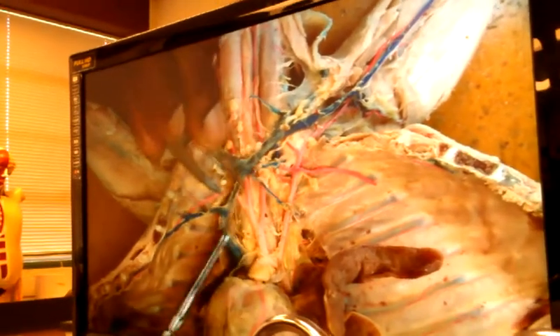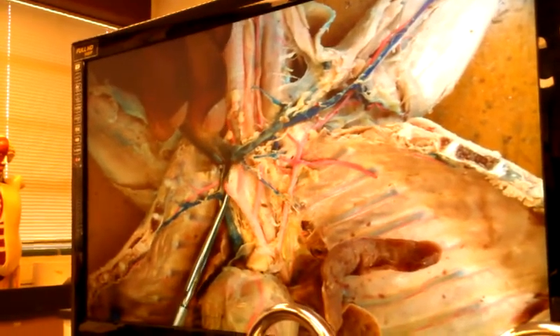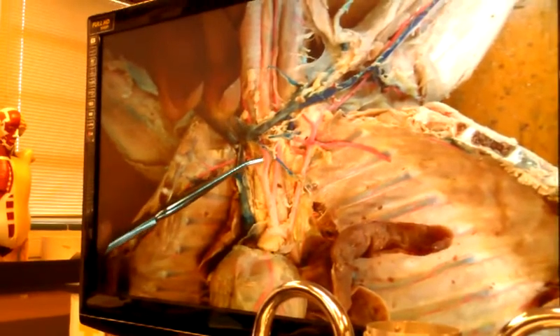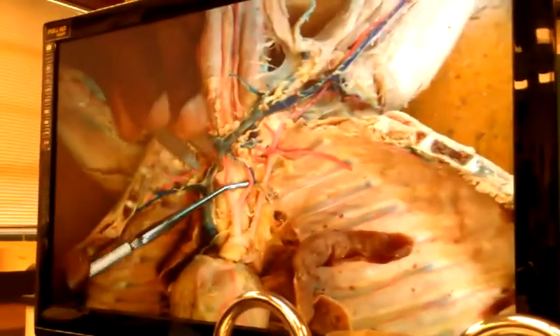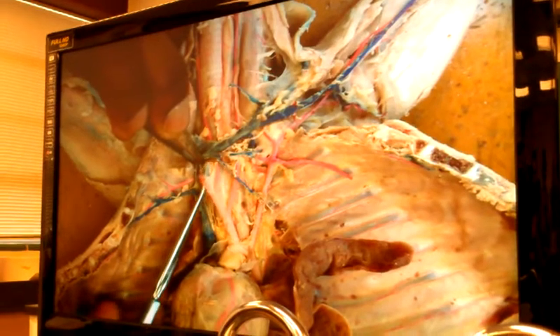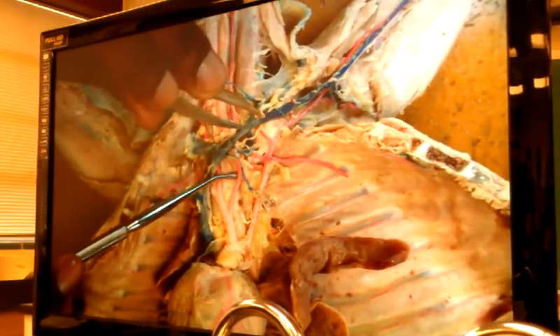But show me again, Mr. Gilmore, what are the three main structures you see coming off? One is going toward the right arm, so we're going to call him right subclavian artery. Then there's one going right beside the trachea. That name, he is right common carotid. So that makes this left common carotid. Start over until I get y'all to say it. What's this one? Right subclavian. Right common carotid. Left common carotid.